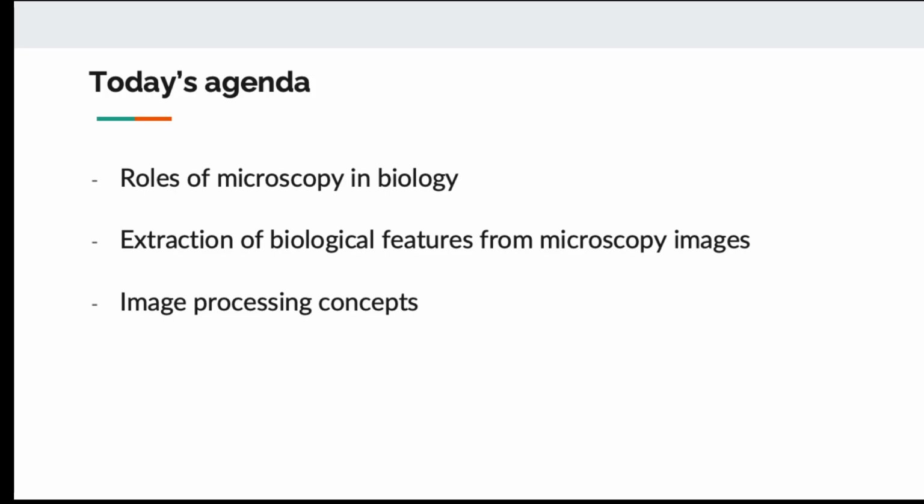So today's agenda, we're going to talk about the concept of microscopy, which I think you are more familiar than me as a wet lab person. We're going to talk about how we can extract biological features or biological knowledge from microscopic image. And we're going to go over some image processing concepts that whenever you use image analysis tools or read papers about imaging software, you're going to see these concepts. So hopefully today's content will be beneficial for your work with microscopy as well.